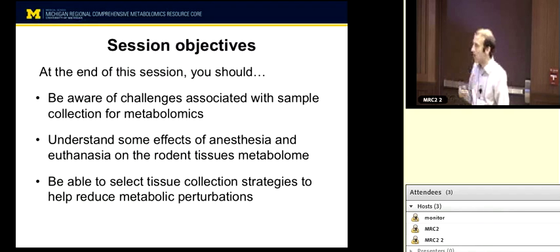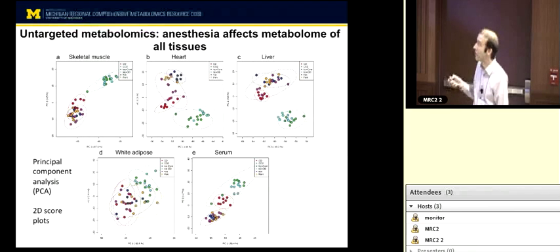There will still be ongoing blood flow as the animal is anesthetized as you go on to the later tissues. If liver is what you really care about, and you want muscle as something extra, you might choose to begin with liver, and I'll show you a little bit about how that might affect things later on. But this surgical dissection happened within 1 minute.